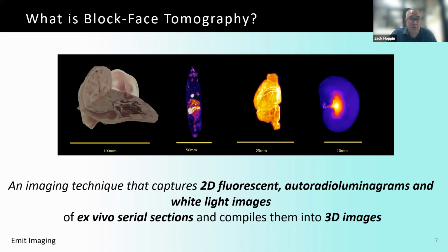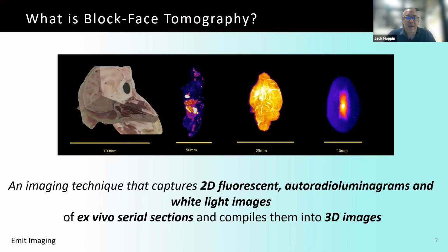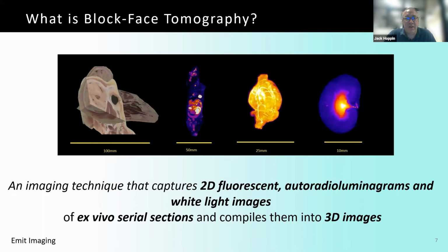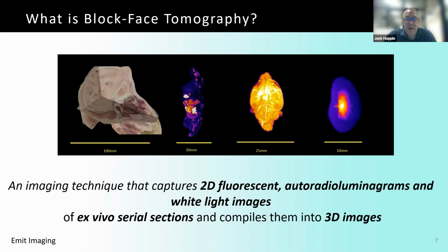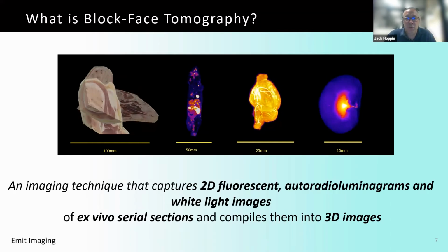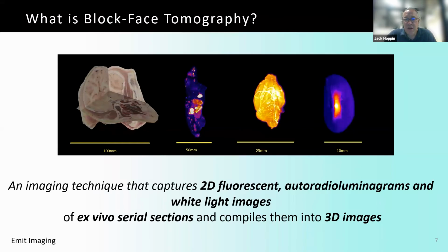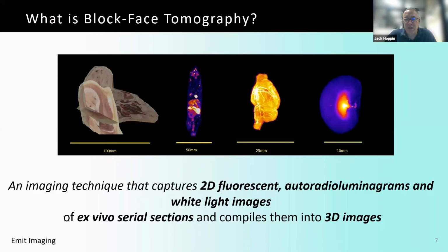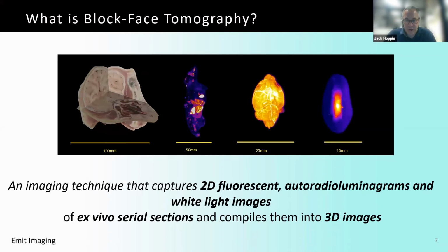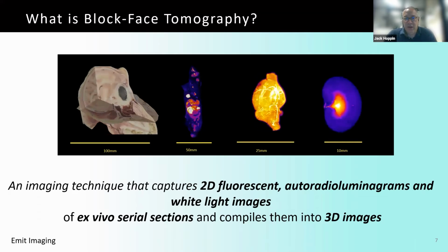In this case, not shown here, there was a radionuclide drug on board that we were looking at the distribution of. That demands 50 to 60 gigs of RAM, and it's only been in the last 5 years that that's become available. As we move on down the line, I'm going to take you through the most common application of the technology, which is whole rodent imaging. There's a highlighted zoom of a brain that's going to be in the oligo application, and then there's a really cool mouse kidney highlighting the distribution of a drug at a really, really high resolution.